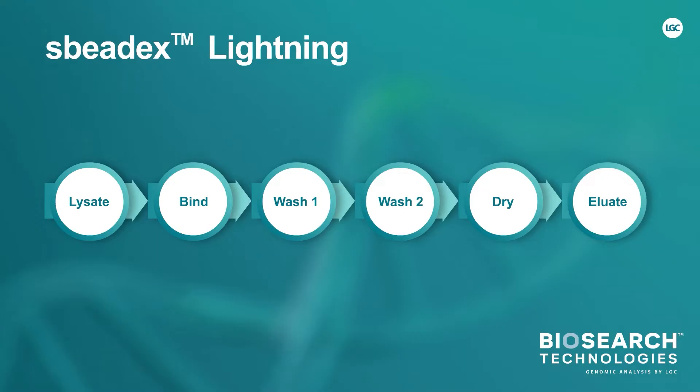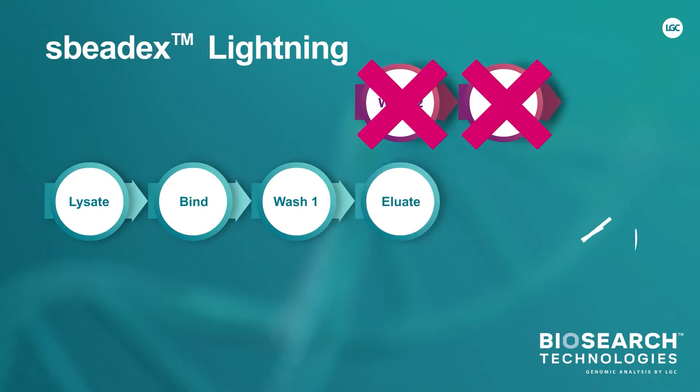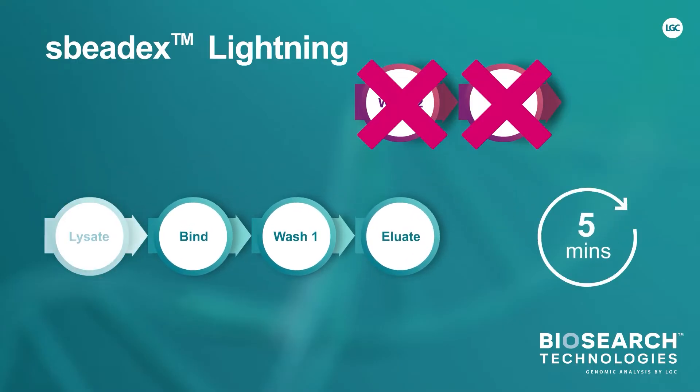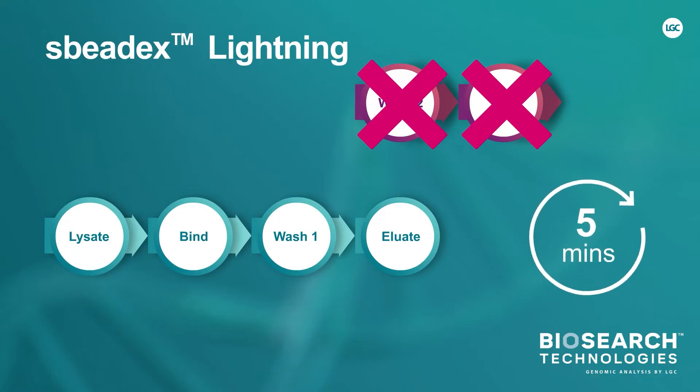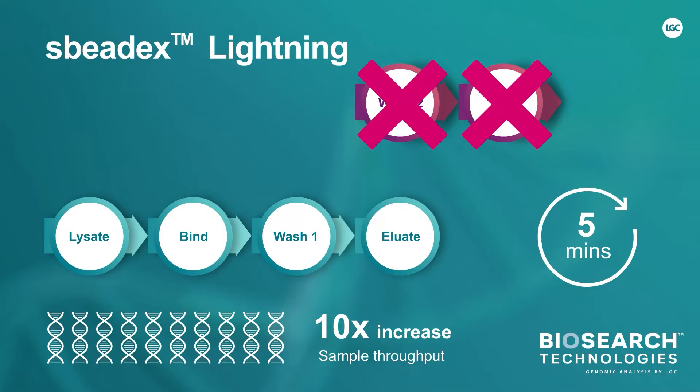The revolutionary SpeedX Lightning magnetic bead-based technology is a game-changing innovation that reduces the purification workflow to around 5 minutes, while still delivering high-purity DNA with high yield. The very fast and simple workflow — bind, wash, eluate — can save you up to 40 minutes per sample and can increase sample throughput by up to 10 times versus competitors.